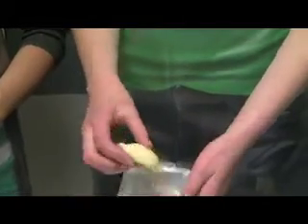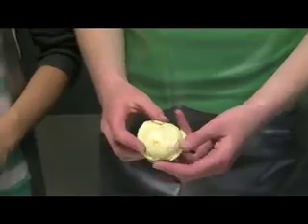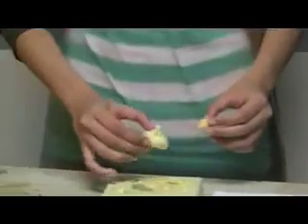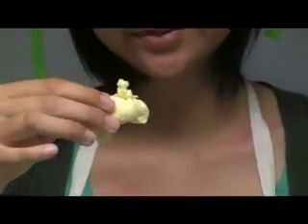As you can see, this type of polyurethane foam is not flexible but rigidly holds its shape. However, we can pour the reactant mixtures into a mold to form any shape we want. And here's the product after we pour it into the mold. As you can see, it keeps the shape of the mold and has a rigid structure.